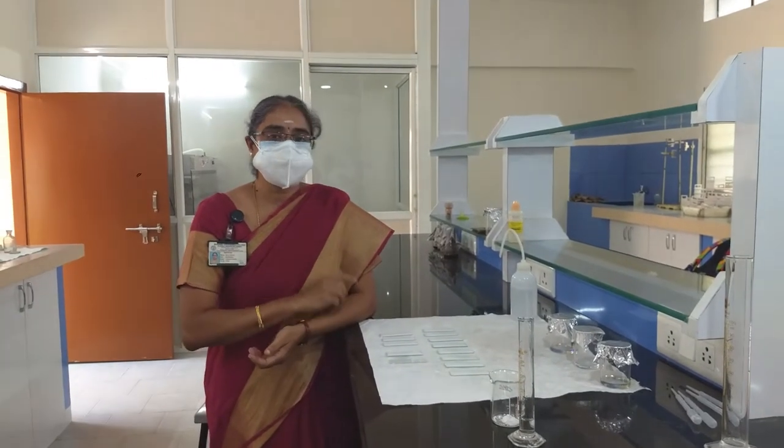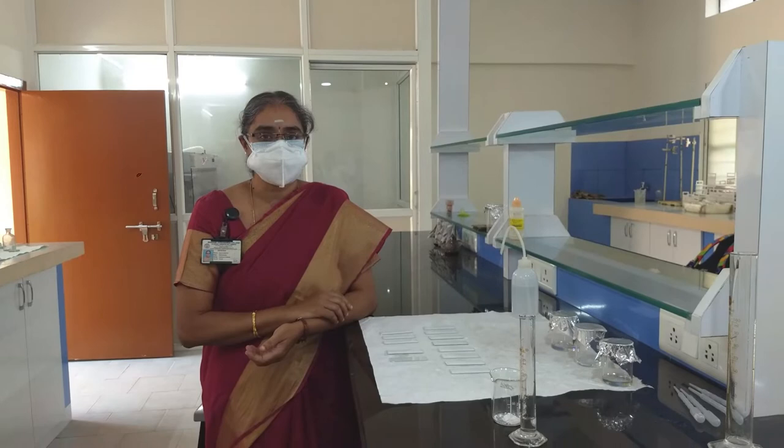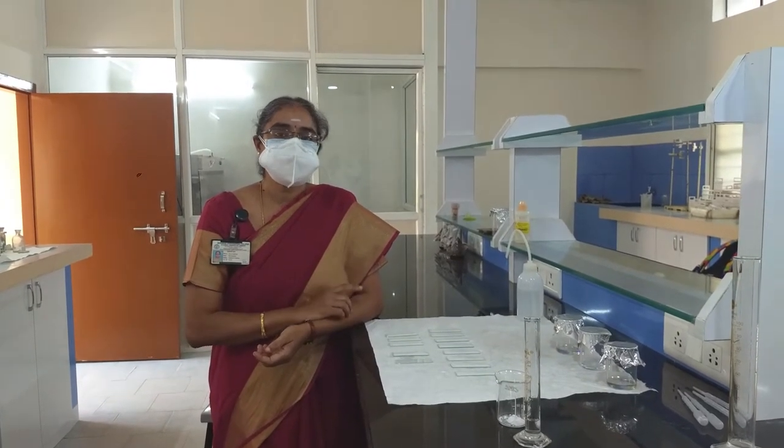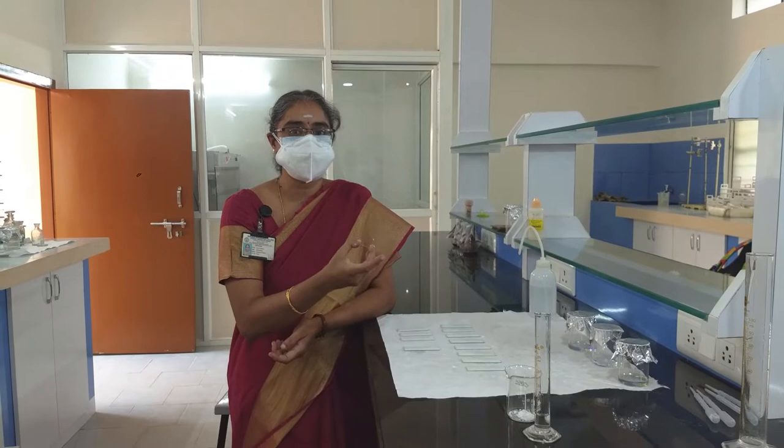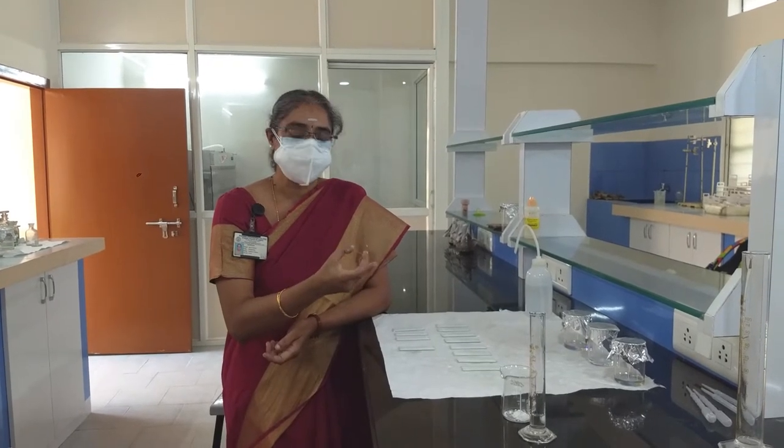Then you have to take silica gel G, which is going to be the stationary phase. Silica gel G — the G stands for gypsum, that is calcium sulphate. The calcium sulphate present in the silica gel helps adhere the silica gel to the plate so that it will not run down when the plate is placed inside the mobile phase.